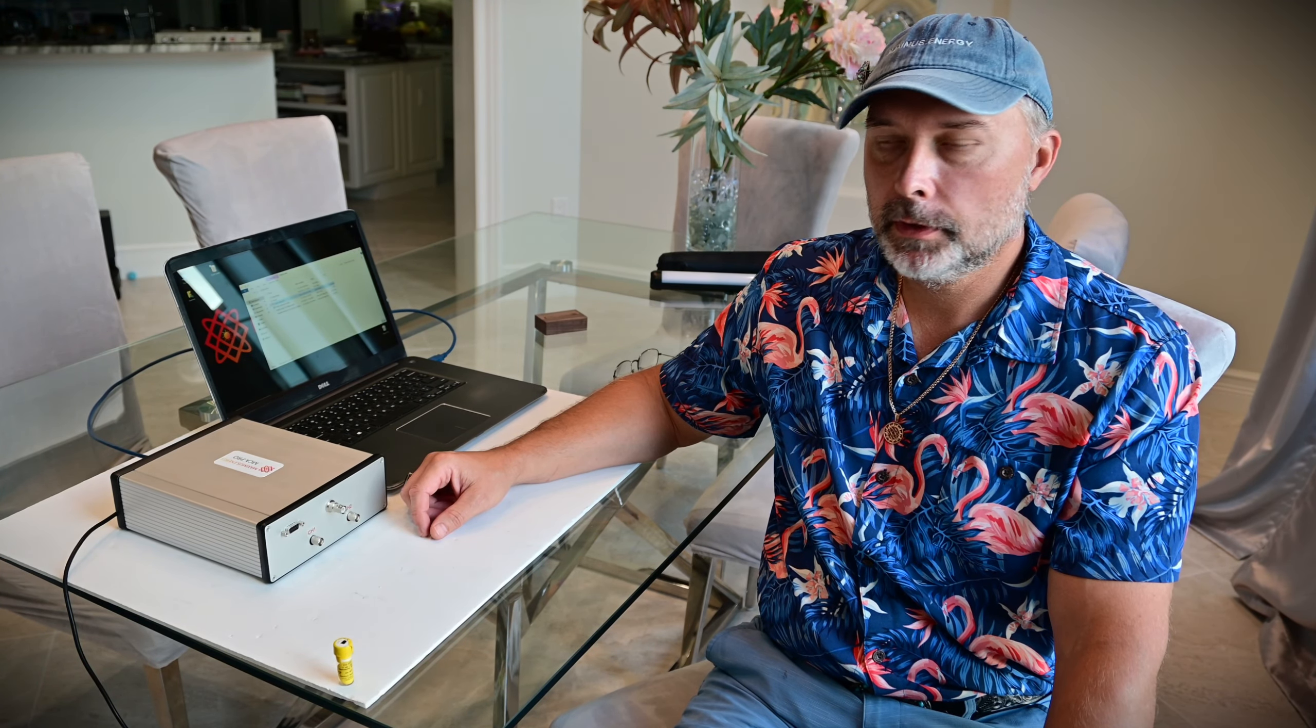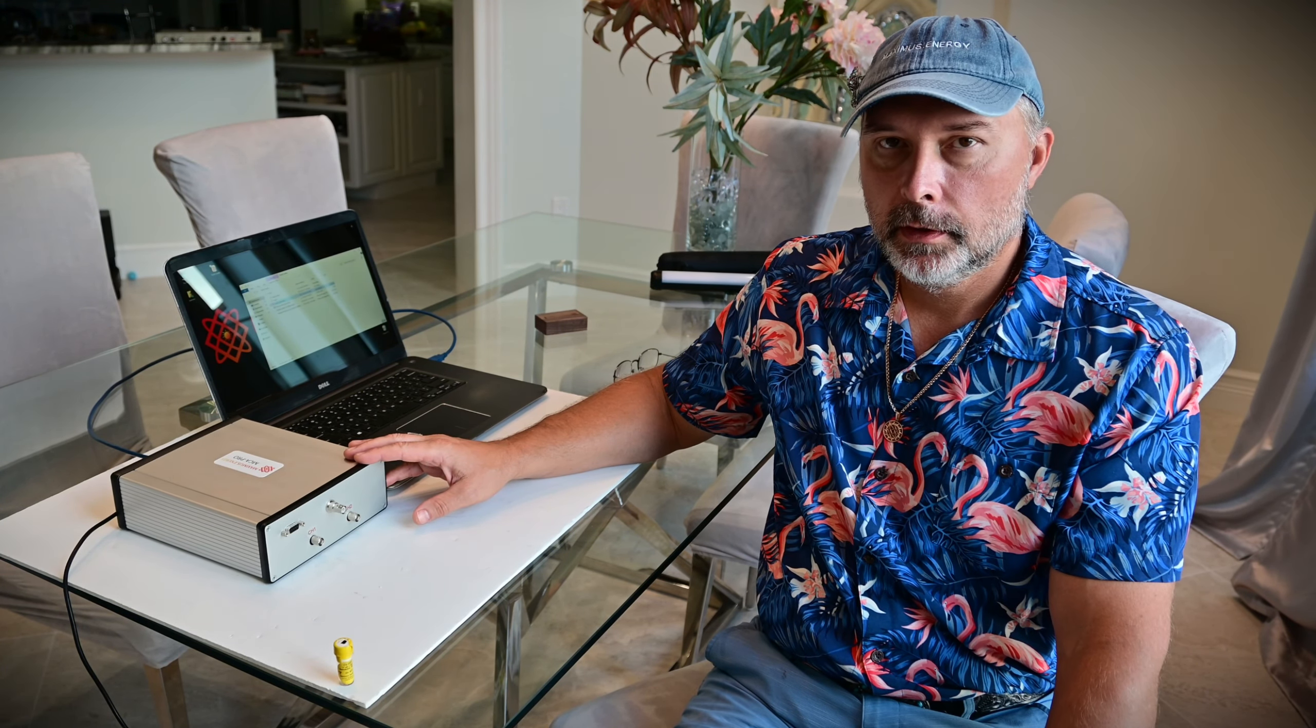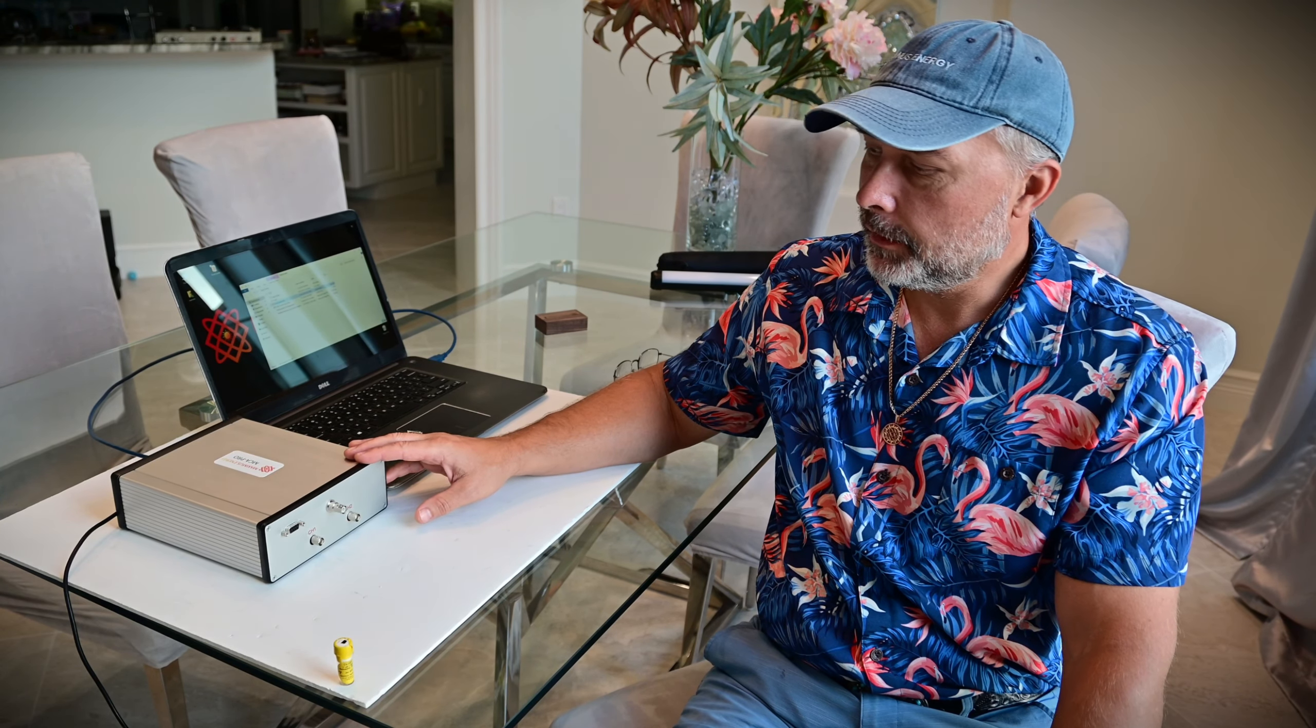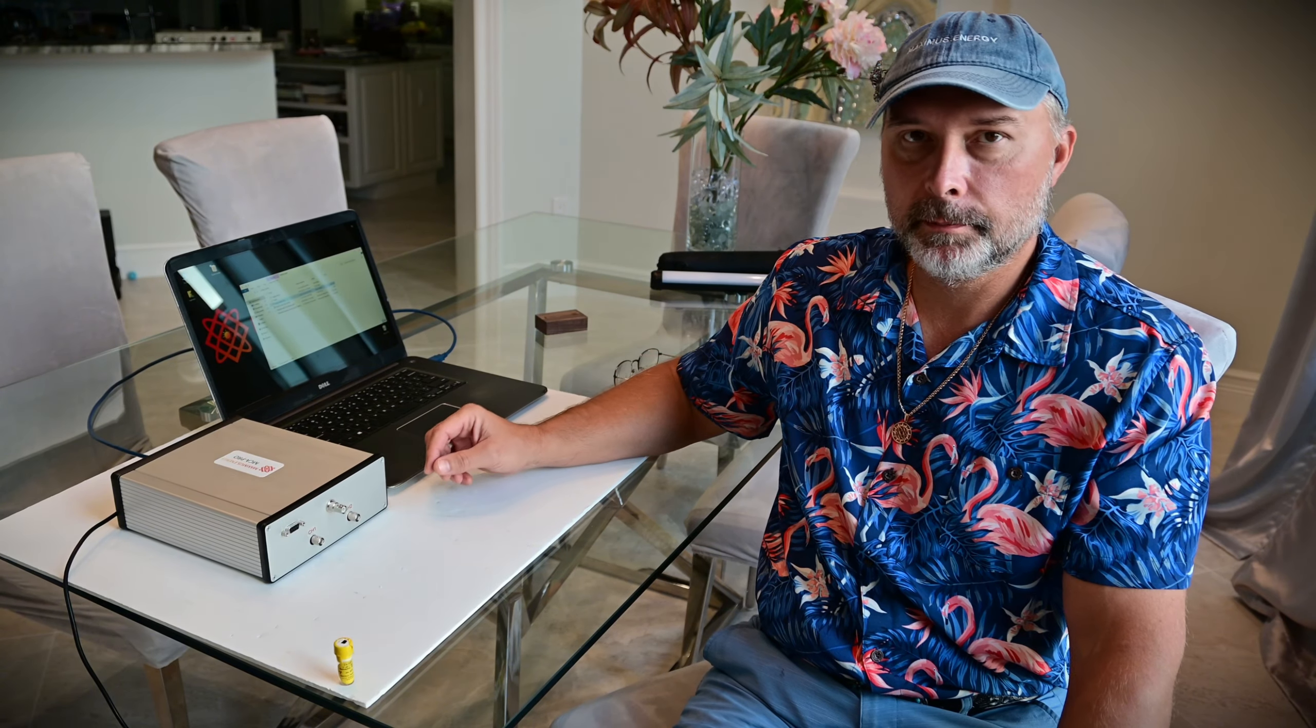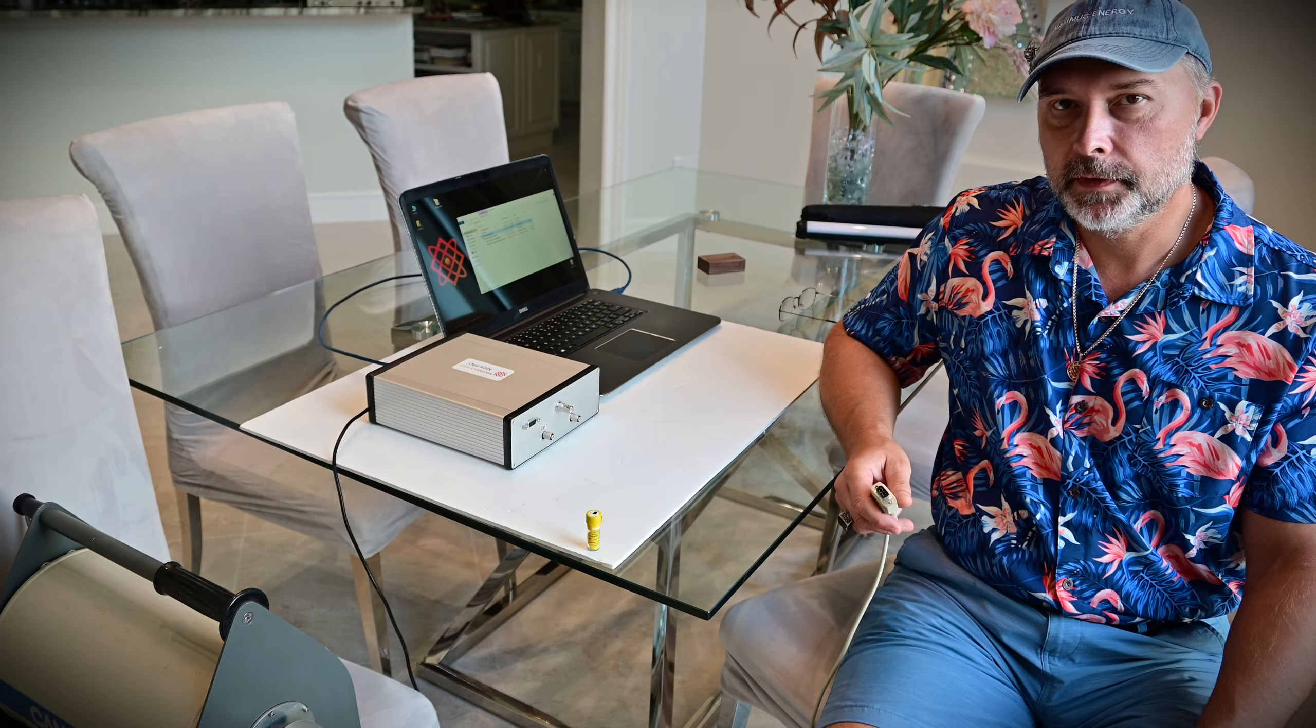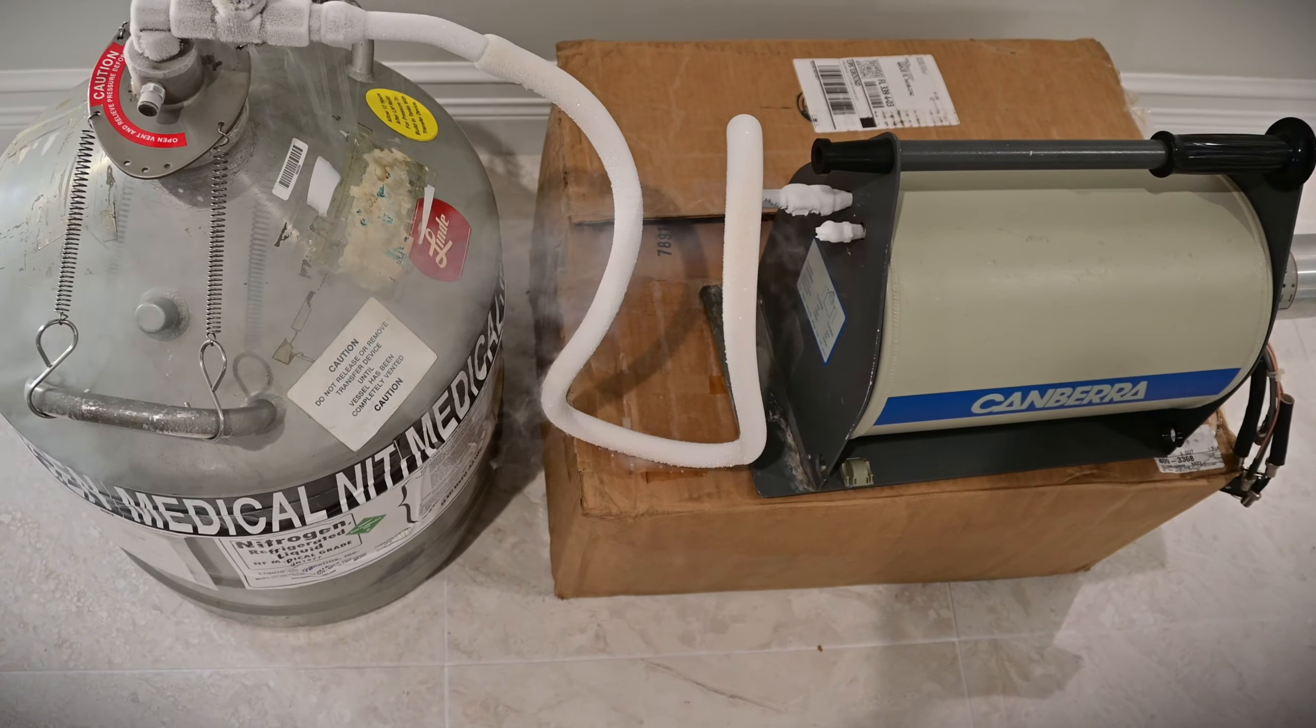Today I'm going to show you how to use MCA Pro with a high purity germanium detector. For the MCA Pro to work with high purity germanium detector, you need a version of the MCA that comes with the pre-amp power connector, which is DB9 mounted on the front panel. Before you plug in your germanium detector into MCA Pro, you need to fill it with liquid nitrogen and make sure that you have sufficient time for the detector to cool.